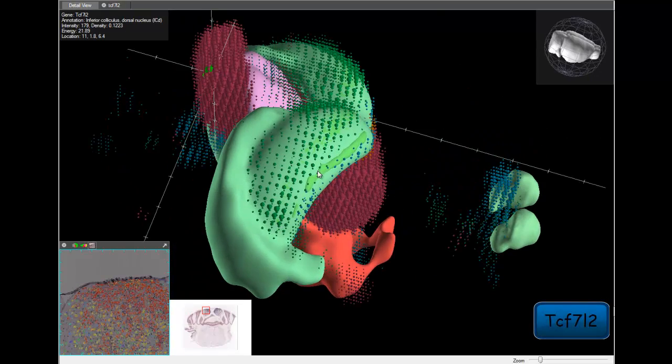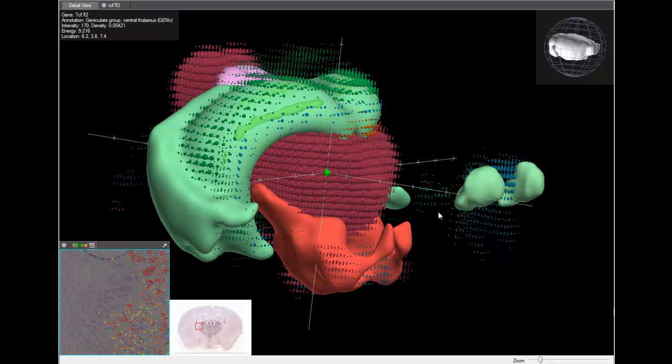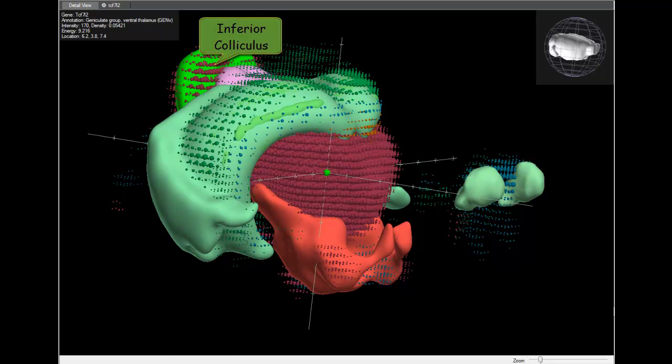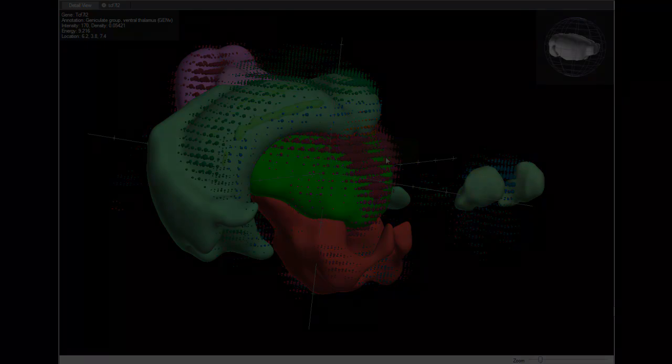This particular gene, TCF7L2, shows a very high specific expression in the inferior colliculus and in thalamus.